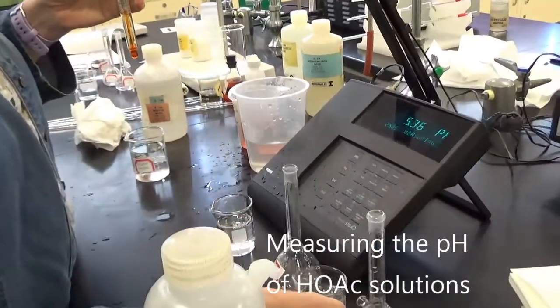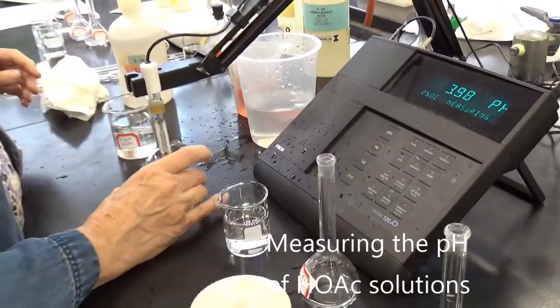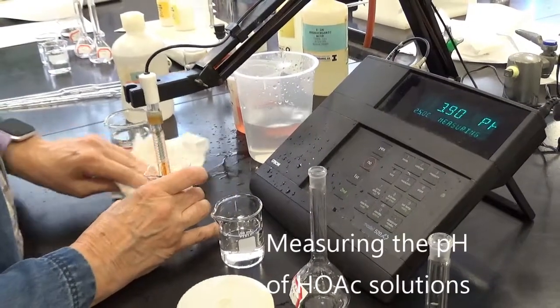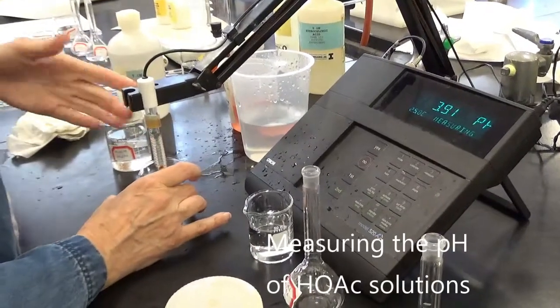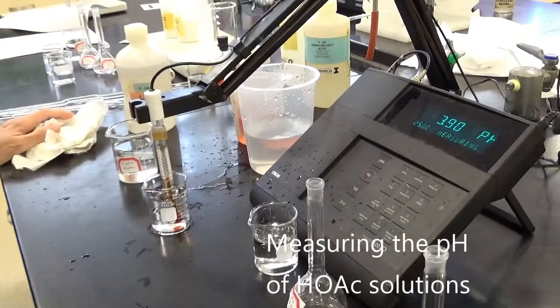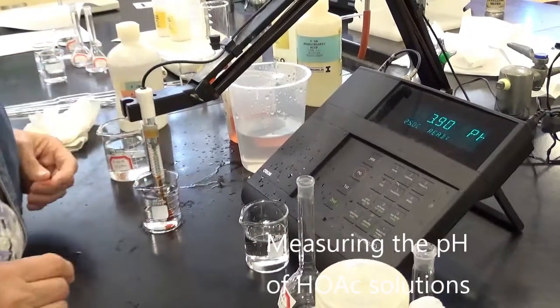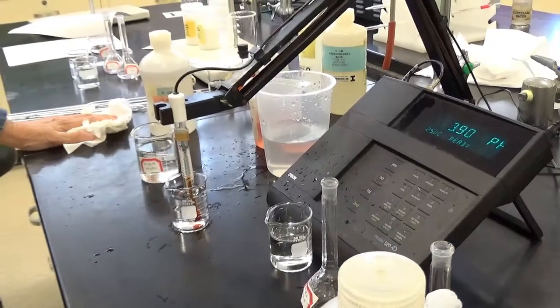And now the third solution, which is the second dilution. Spilled a little bit. Let it stand. There we go. 3.90. Okay. So that's what we have for diluting a strong acid and diluting a weak acid.